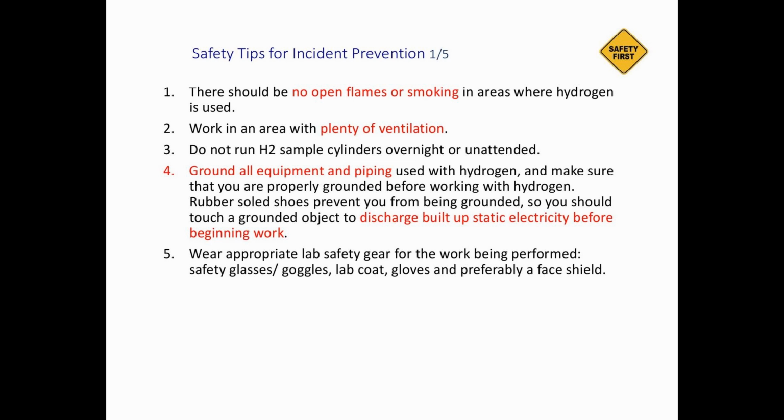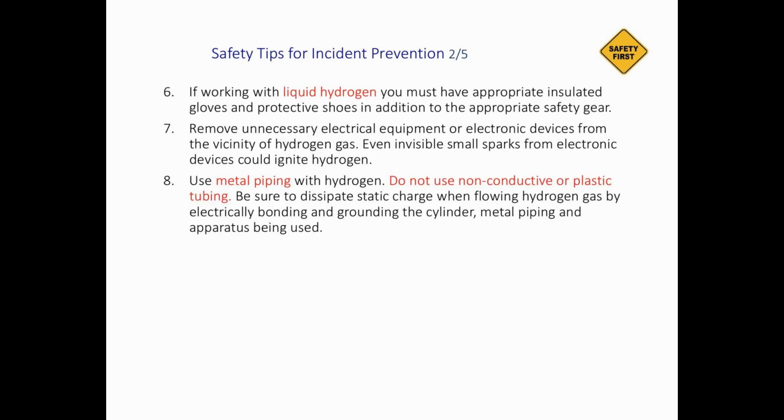But in the research laboratory, if you perform some synthesis reaction, then you need to consider that in case there's an explosion. Working with liquid hydrogen, I don't know anybody in this class working with liquid hydrogen, but you must have appropriate insulated gloves and protective shoes in addition to the appropriate safety gear.